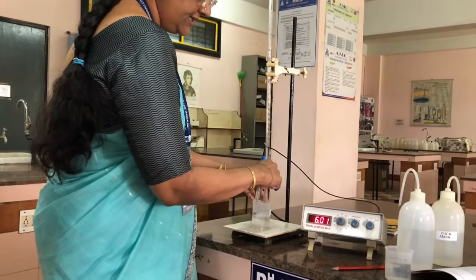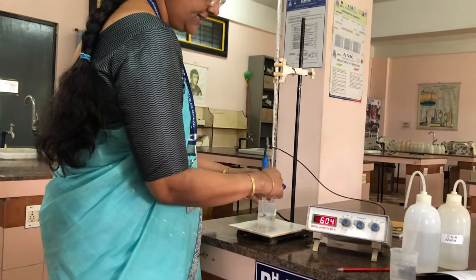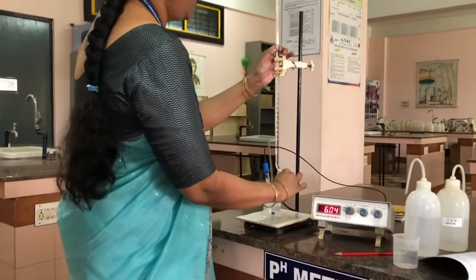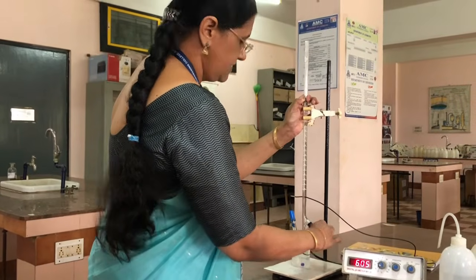Now it is showing, see that it's increasing drastically. So now it is 6.04. Now again I am adding 0.5 ml. Now it is exactly 6 ml I have added.